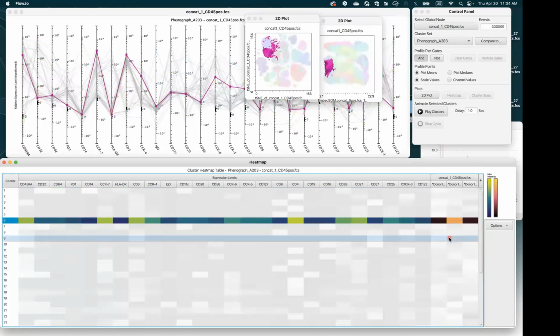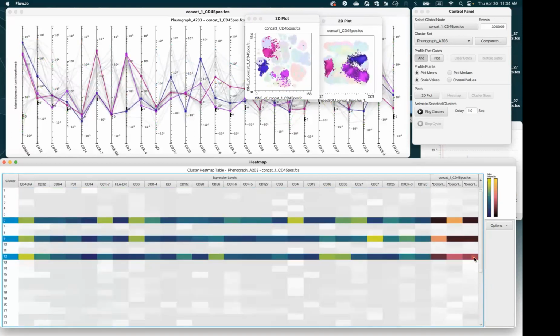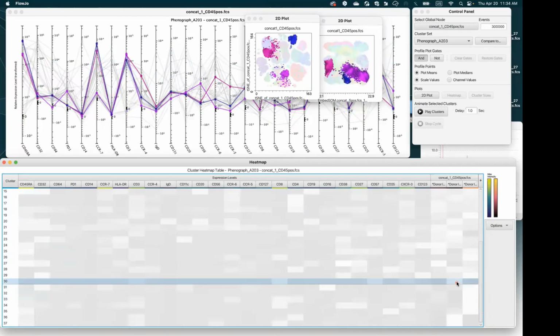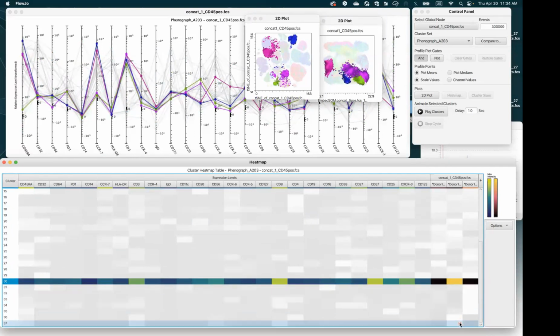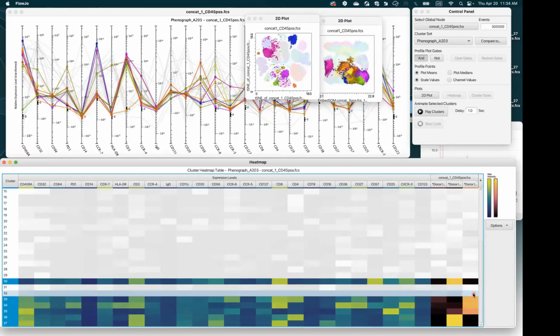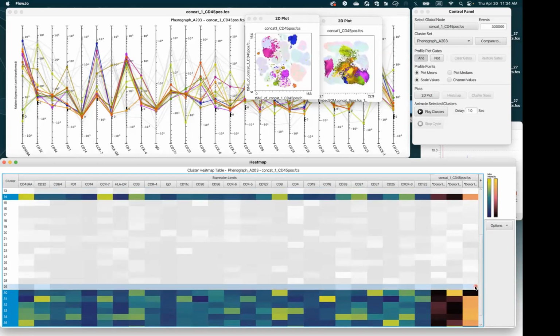And that way I can multiple select all of my differences. So I can check here. This one not so much. So I can trim it down really to the clusters that are significantly different. There's a lot there.